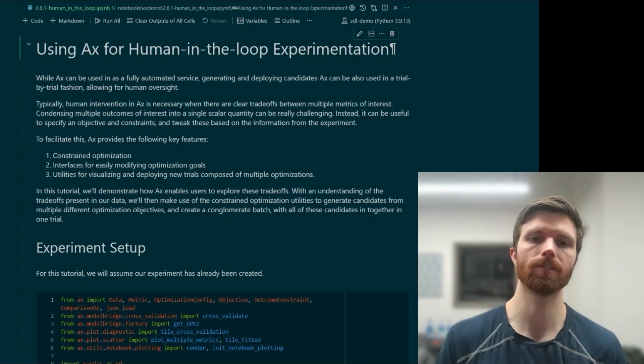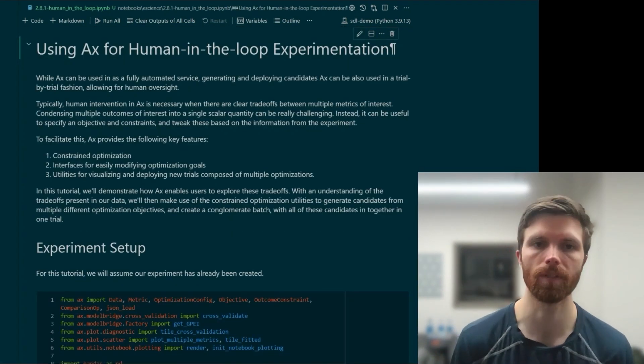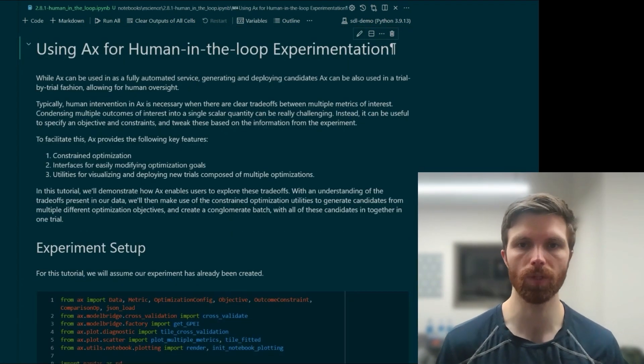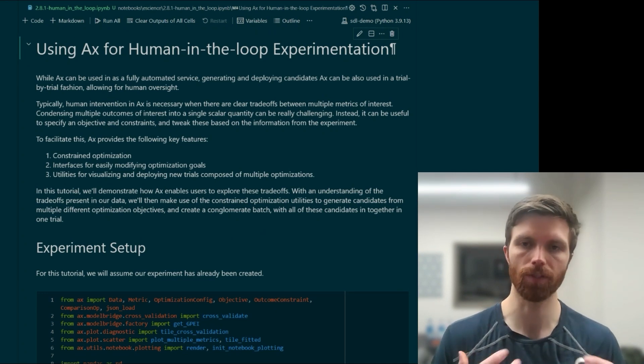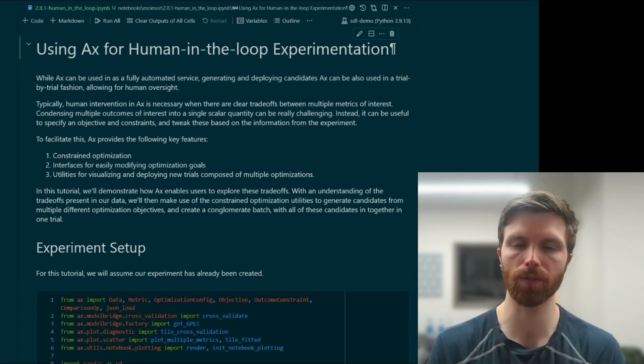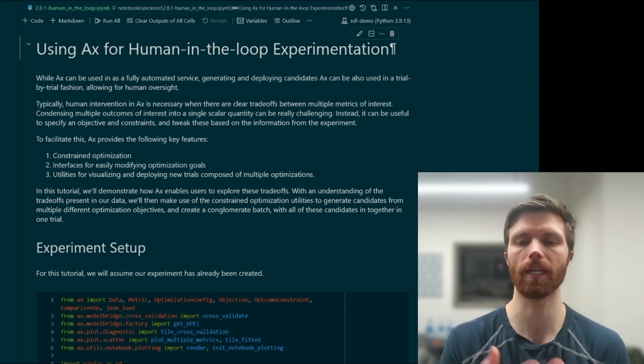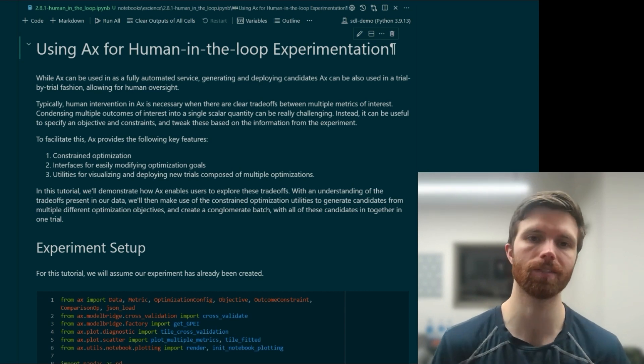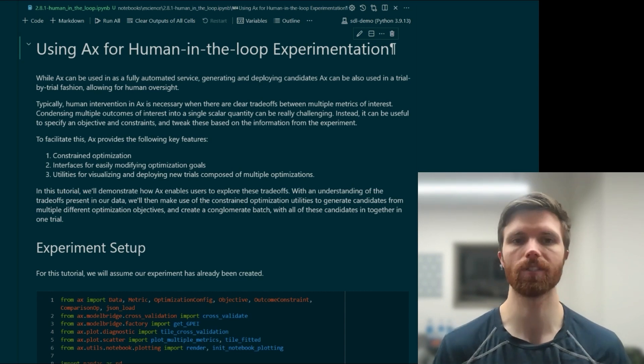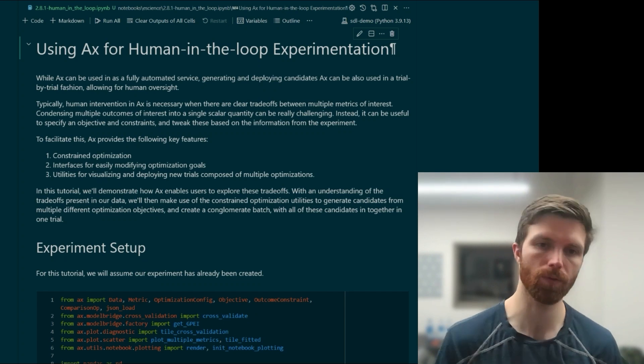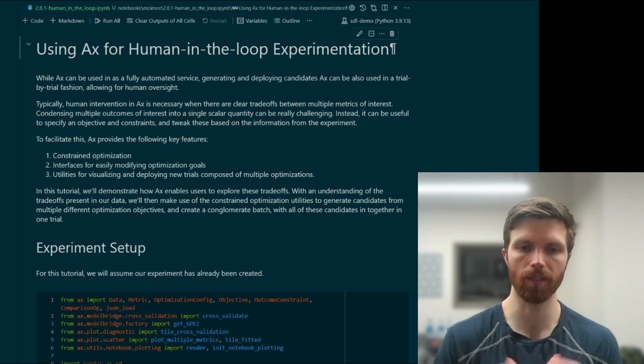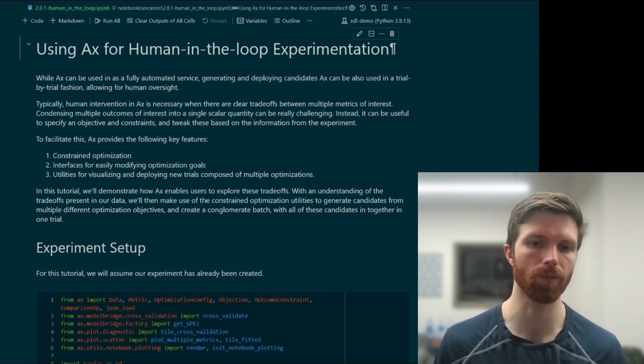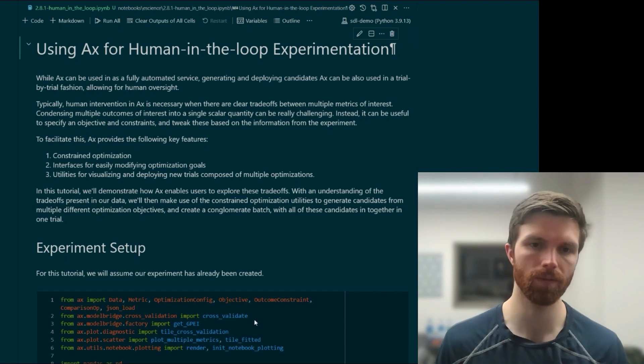Also mentioned that there's another notebook tutorial that goes into some more detail about the user really probing into the model as you're deciding on the next set of candidates and giving this human oversight to it. I won't go through this notebook, but just know that it exists in the Ax tutorials and we'll move on to the next one.